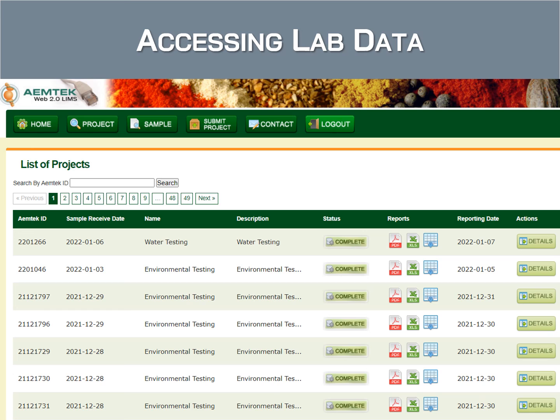Please ask your account manager at AEMTEK for login instructions to access your results data online in the LIMS program.